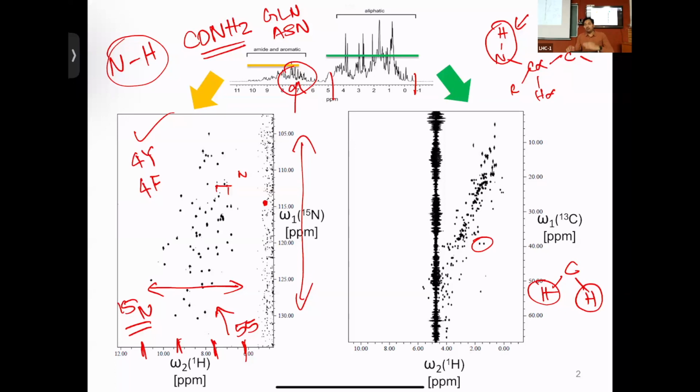Not really. Here we are talking about the influence of the aromatic ring on the NH. The aromatic ring chemical shifts come somewhere else. But if you have an NH that's close to an aromatic ring versus not close to an aromatic ring, the chemical shift will be different. And remember, if the NH is above or on the side, the chemical shift will be different again.